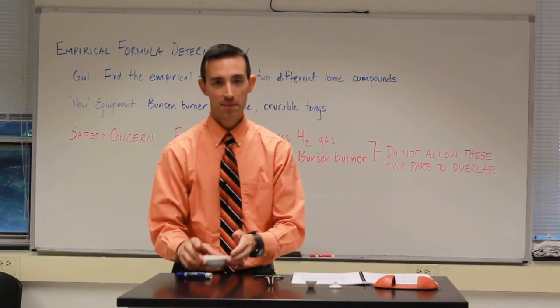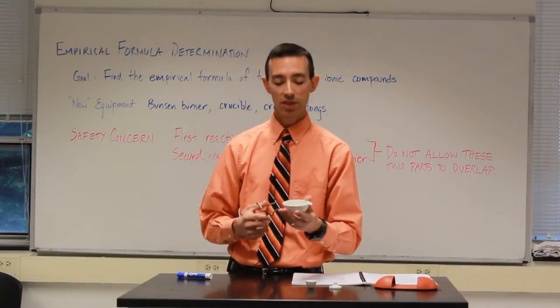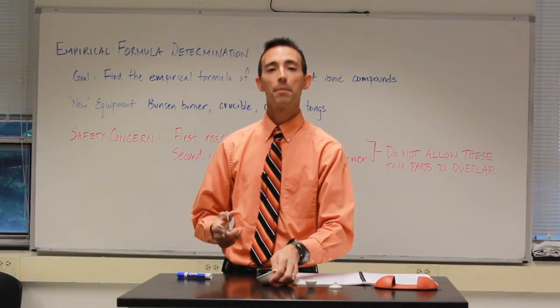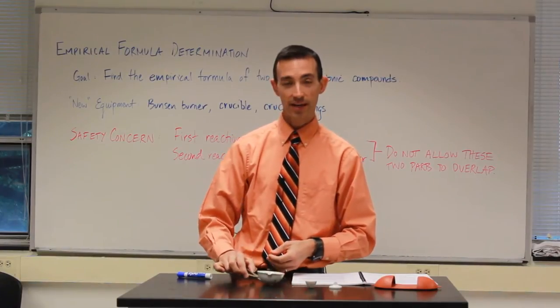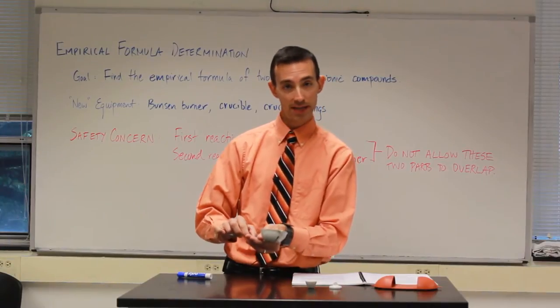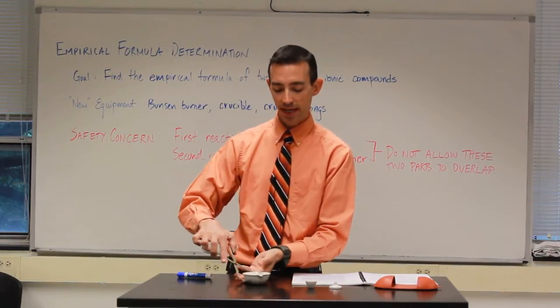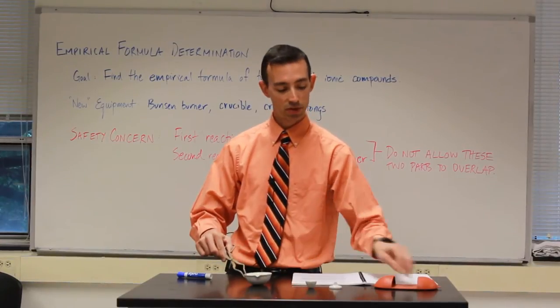This other porcelain piece that I have on my bench today is an evaporating dish. We'll use this in the first part of our experiment. Please do not try to pick it up this way. It will not rest as easily. If you have a sure set of hands, you might be able to manage it this way. A better way to handle the evaporating dish is from the side with the crucible tongs.